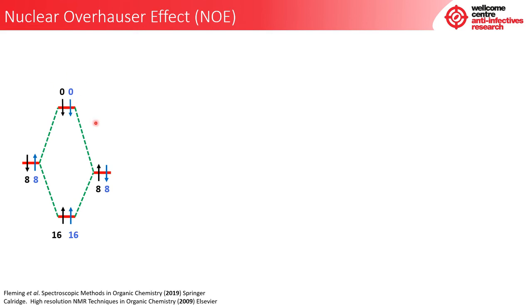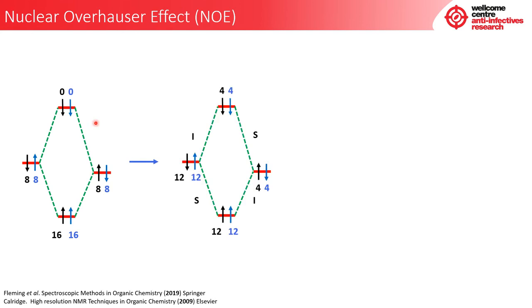Now, when we produce this pulse, give the source spin its pulse, what we see is a difference, as in nuclei have started to move into these different energy states. And what can we see here? Well, we see that the alpha-alpha state has lost, the intermediate on this side here has gained, this intermediate side has lost, and the high energy state has gained. Now, how do we know that that's what was going to occur?